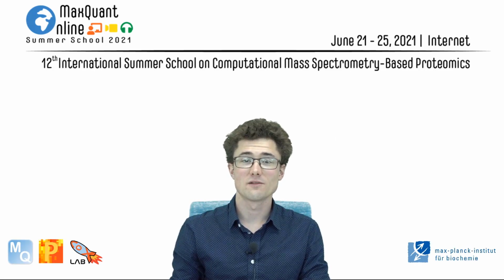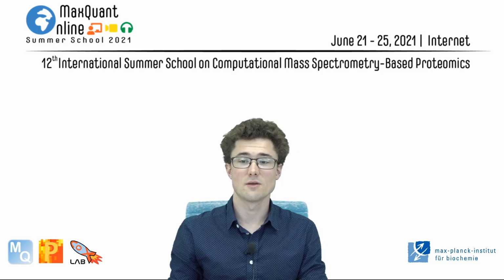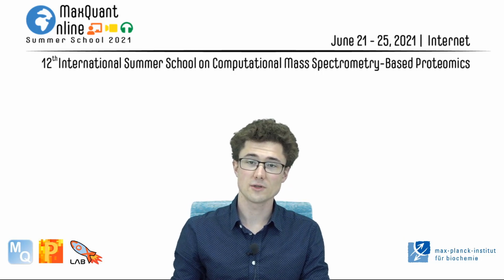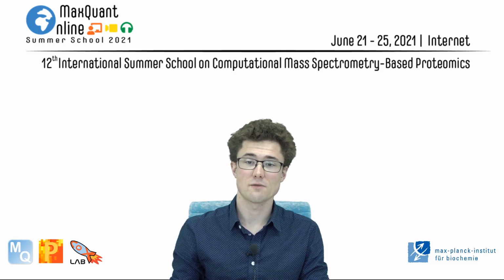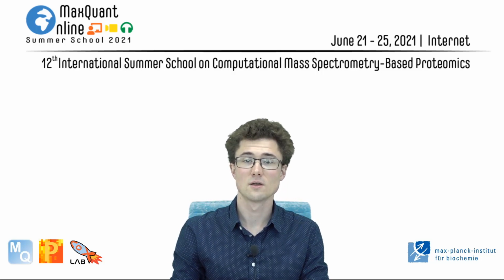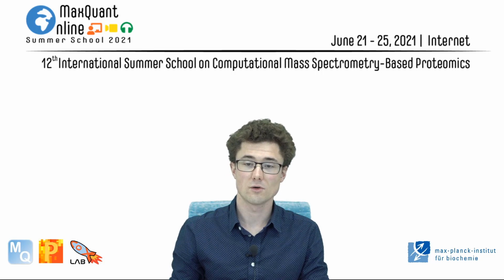Hello, I'm Béla Frohn. I'm a PhD student at the Max Planck Institute of Biochemistry, and I'm going to present the first half of the MaxQuant basics, so the basic workflow of MaxQuant.